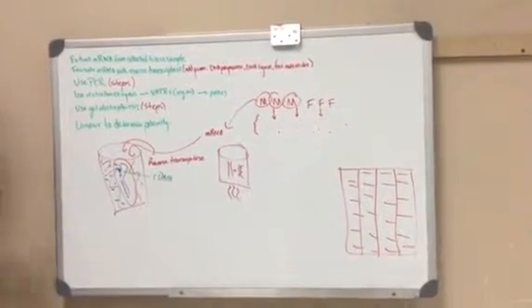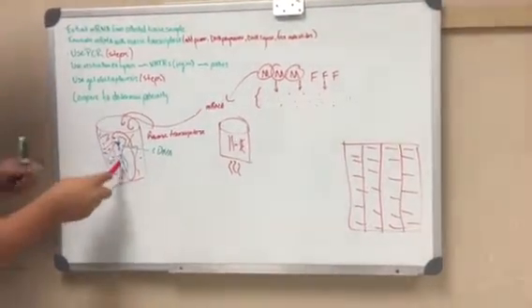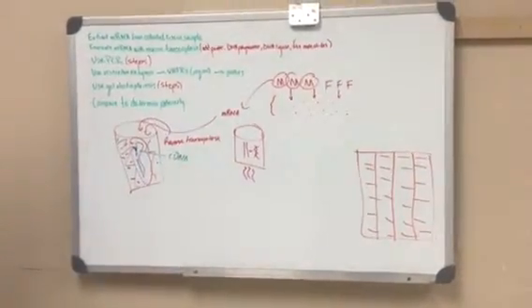This is called the annealing process. So once it's cooled, we have to add a similar primer to what we added here. So we're going to add a primer.